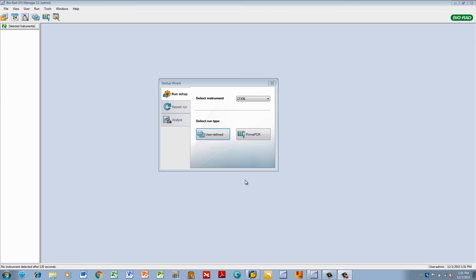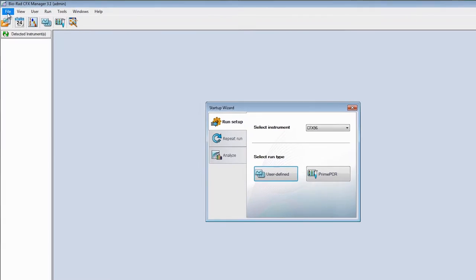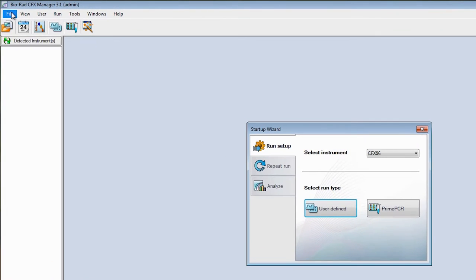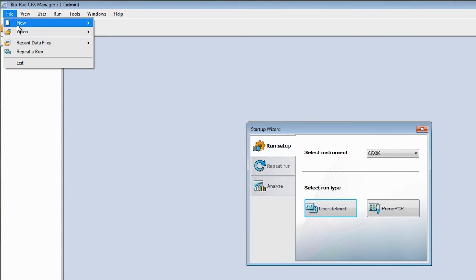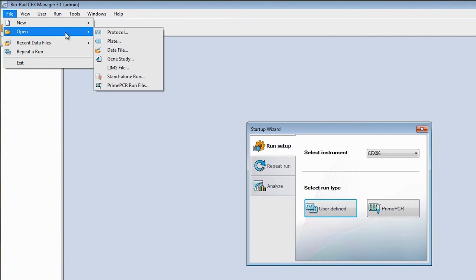OK, back to setting up replicates. After launching CFX Manager software, open the plate you previously set up that you now want to assign replicates to.